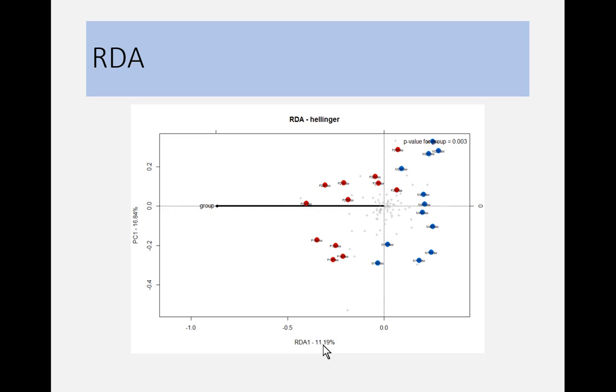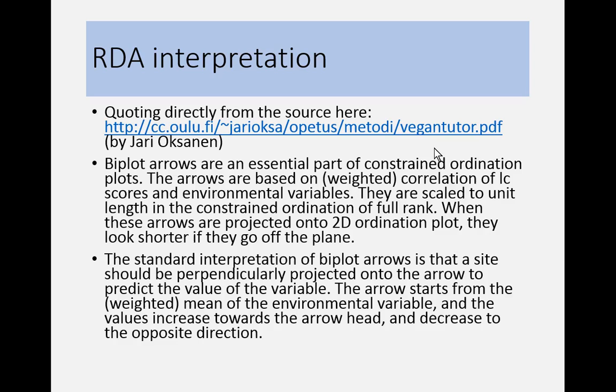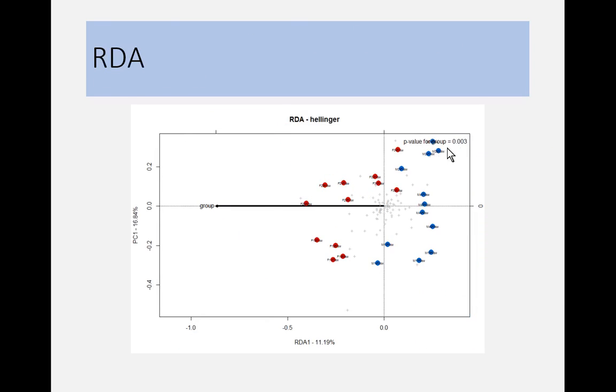And then after the following slide, you show p-value and you say it's associated to gender, but in that case, can you find out what the p-value is for those arguments that you are like both? You mean also for these ones? Say this p-value is showing gender, right? Yeah. And what about the other one? Can you find out what it is? Yeah, in the analysis you can. But in Chipster, it's currently only implemented so that you can only use this group column.